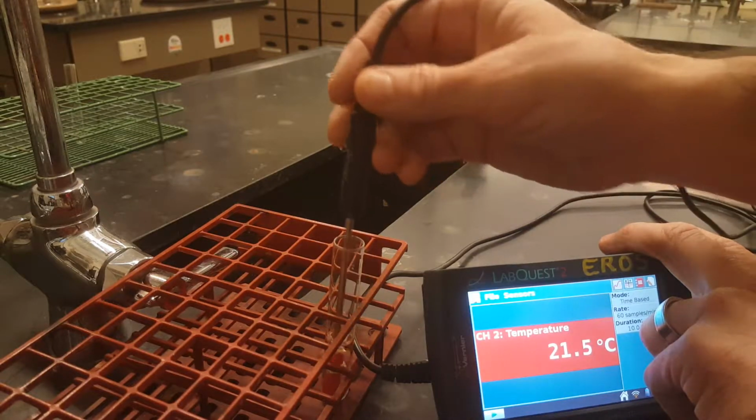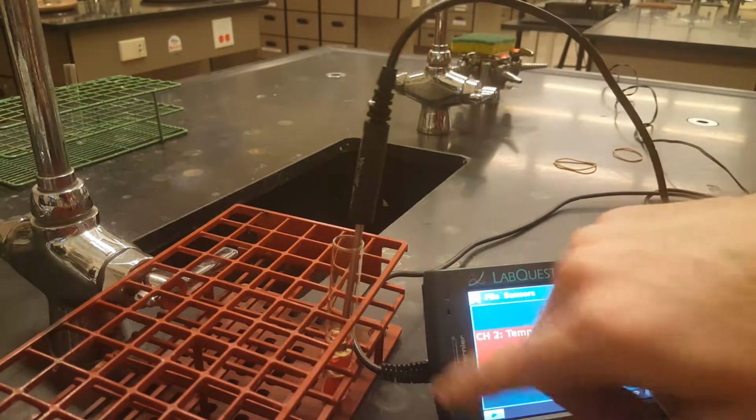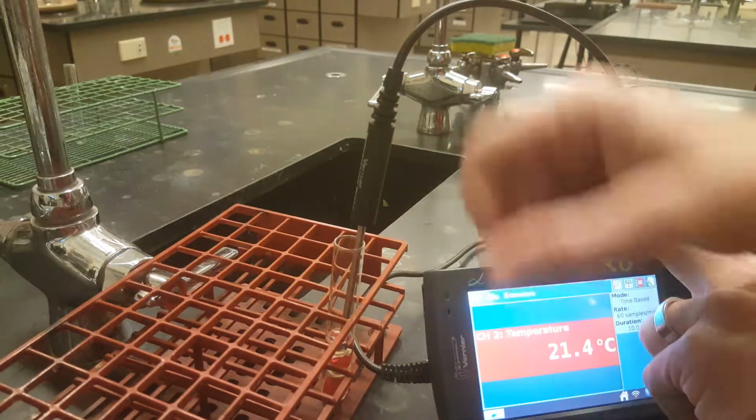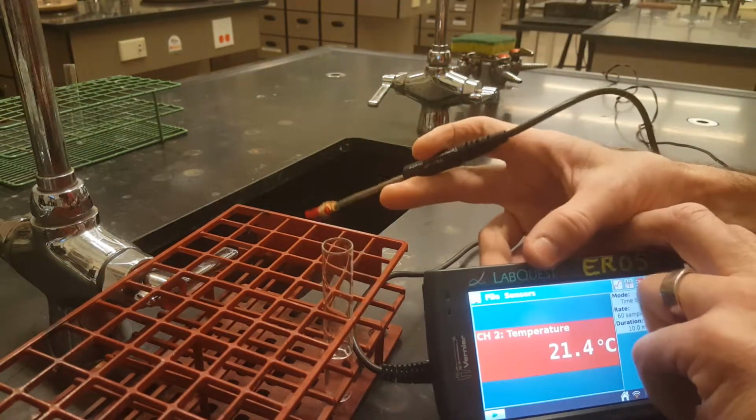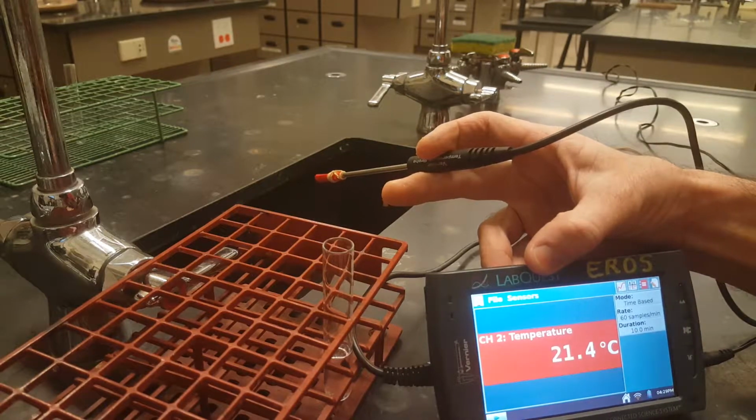I've got my thermoprobe soaking up my solution. Actually, it's not a solution, it's my volatile liquid, it's water. And I'm going to pull it out, hang it over the sink, press play.